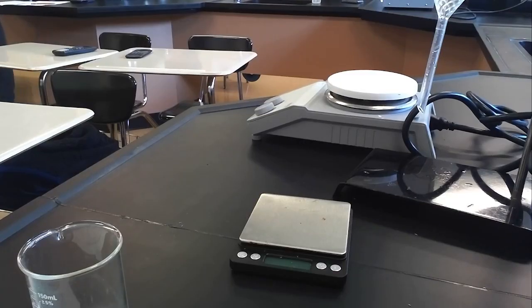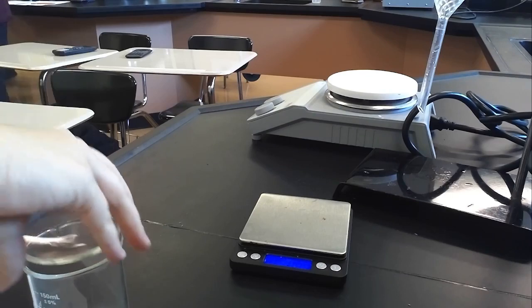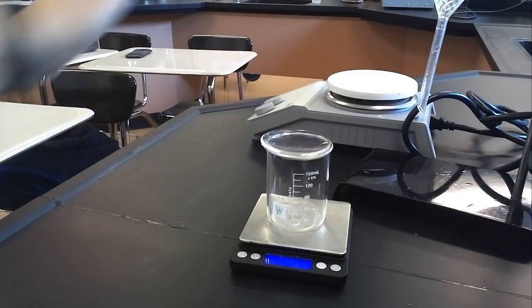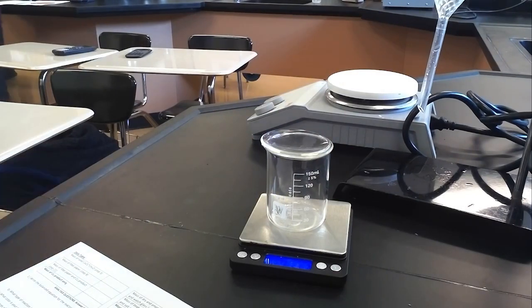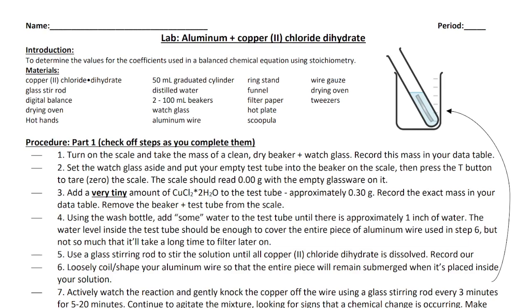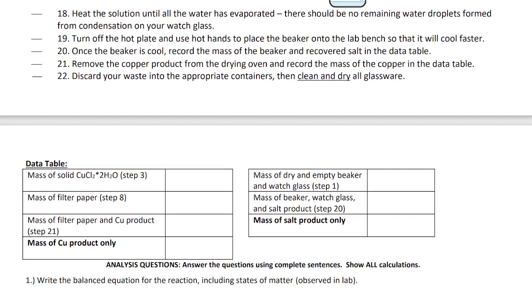Starting with step one, it says to turn on the scale and take the mass of a clean dry beaker and watch glass. I turn on the scale, make sure it says zero, then place my clean dry beaker and watch glass on it. This one weighs 91.17 grams, so I record that mass — the mass of the dry and empty beaker and watch glass is 91.19 grams.